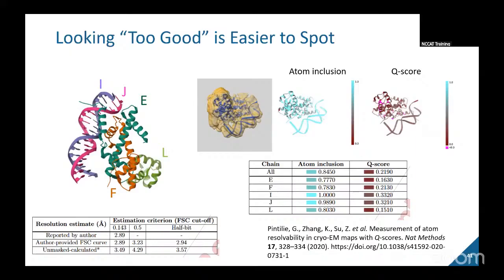It's a good question. This is why we recommend for the consensus volume, before you do the focus refinement, that it is a map-only entry, so you wouldn't even have the model there. For the focused refinements, if you really want to highlight a particular area because it's of significant interest, then it's likely a good idea to include a model with that, and that's fine.